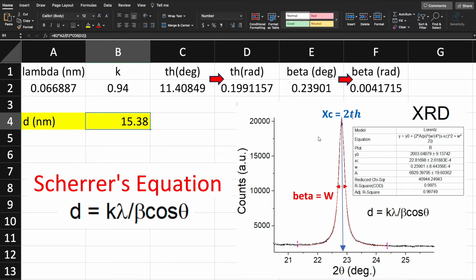k is 0.94, which is the Scherrer constant for spherical particles. Lambda is the wavelength. You will be confused that the wavelength I am showing is much smaller than what we see usually from copper K alpha, which is 1.54 angstrom. Why is it so small? Because I have used synchrotron XRD to record this x-ray diffraction pattern.